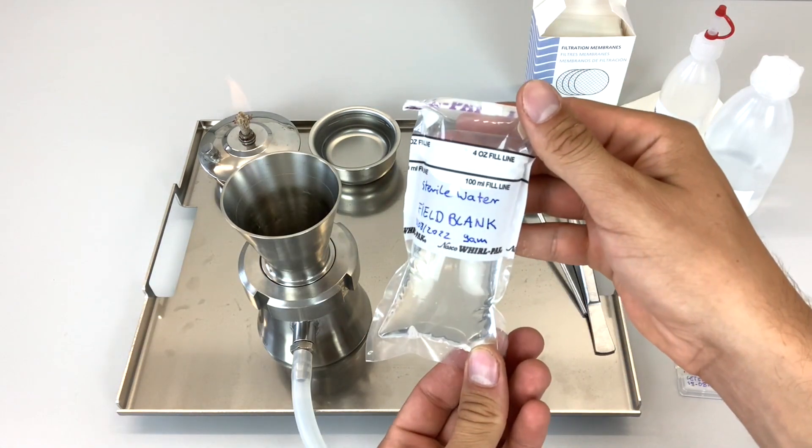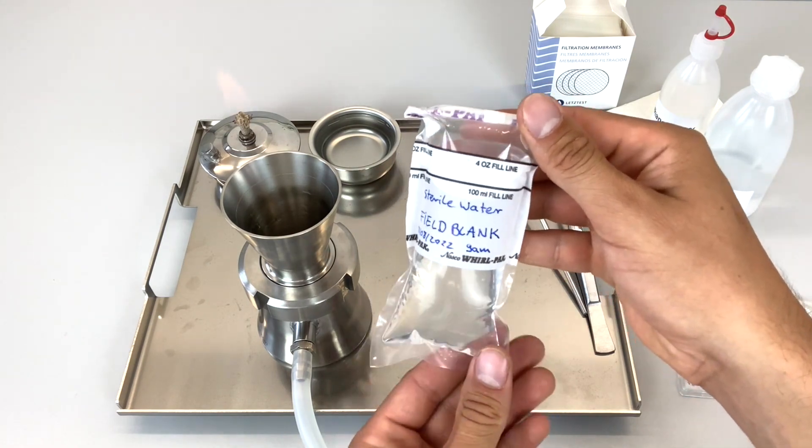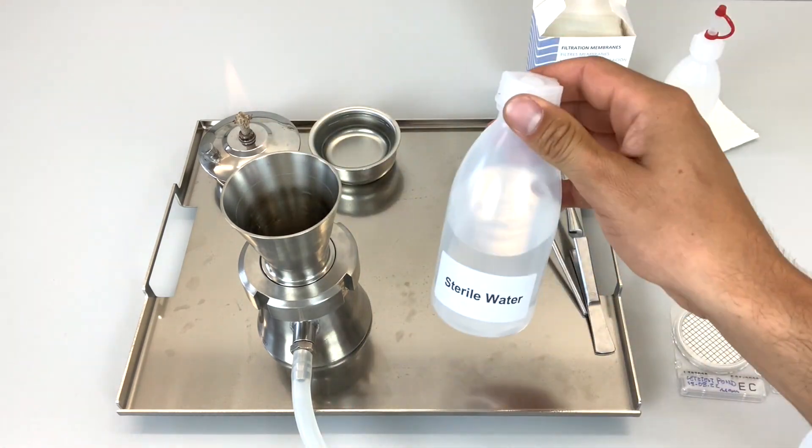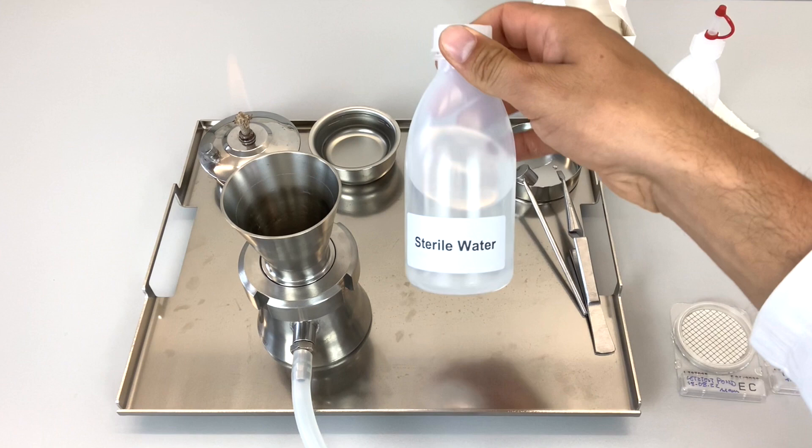For quality control, next to the field blank, we suggest you test also sterile laboratory water, called the laboratory blank. Test it in between your samples. It must show zero bacteria. If it does not, you are facing cross-contamination between samples and your results are not valid. Your sterilization procedure between samples must be improved.